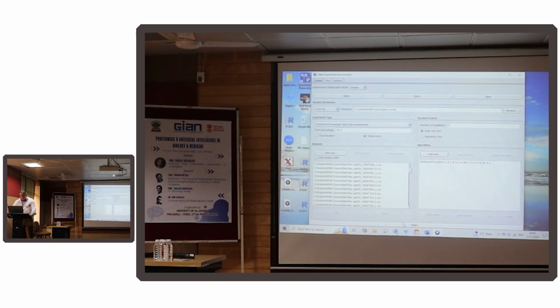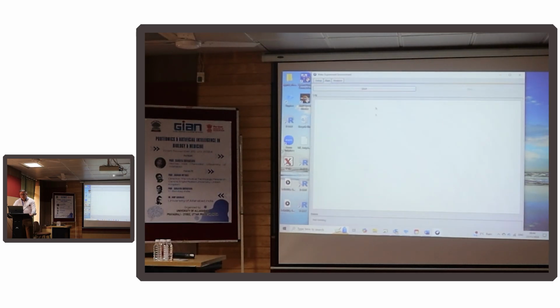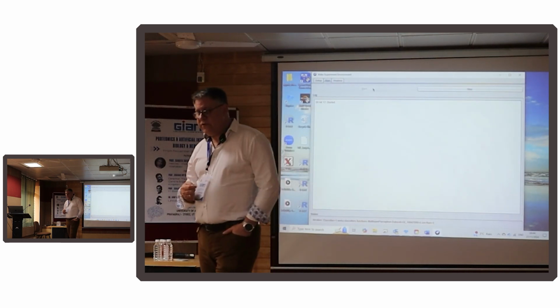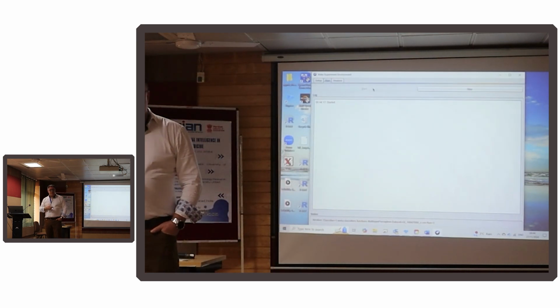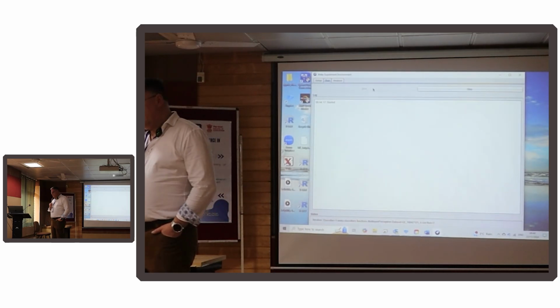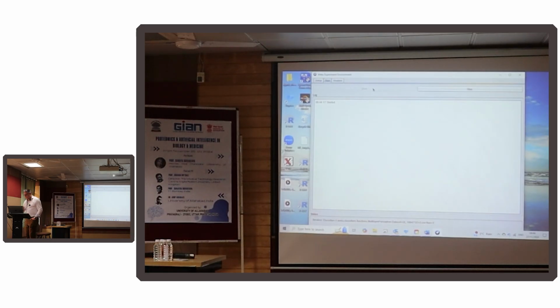I can add notes into my experiment if I want to. So I'm just going to click on Run now and click Start. So it's now working through those data sets, each gene being a data set, evaluating those in terms of their ability to predict muscle age. And we can use the correlation coefficient and the root mean squared error as the selection parameter for that. So it's working through, it'll take a little while.